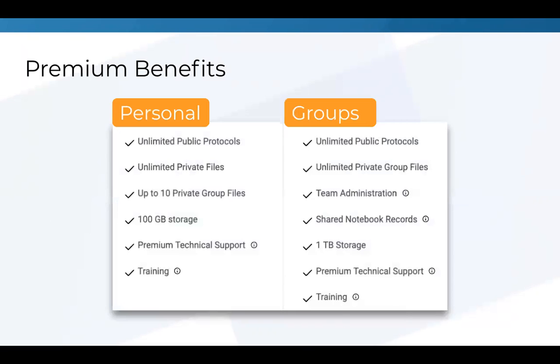And really your premium benefits of this is you have unlimited private files, and also for the groups, you have team administration. So for example, you can have different settings in the group, such as you can decide you don't want anybody to be able to share any files outside of the group or remove any files outside of the group. So this is really if you're setting up a lab group and you don't want the protocols to leave once a scientist leaves the group, so you can make sure everything just stays in that group.